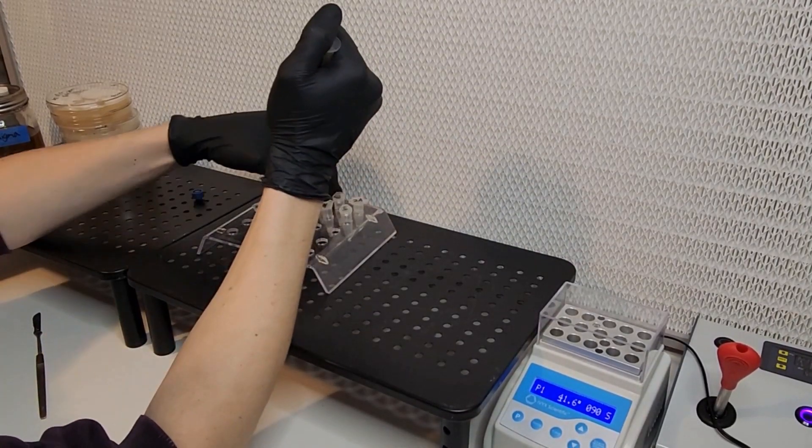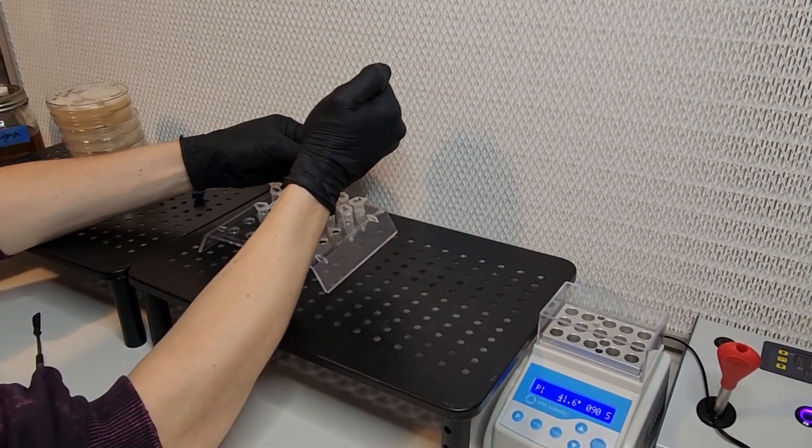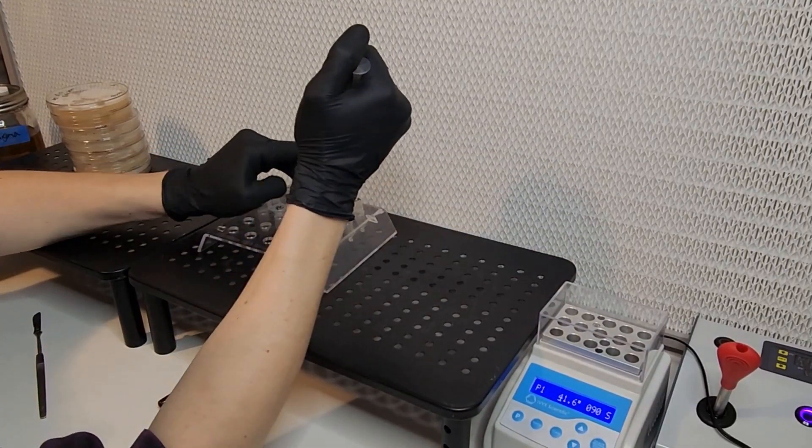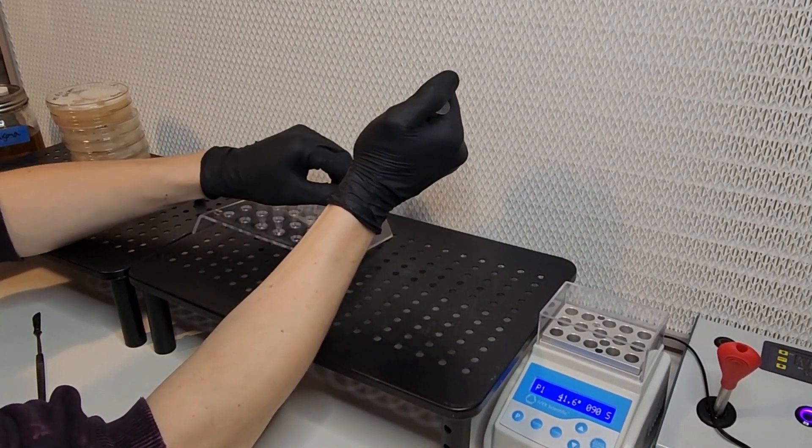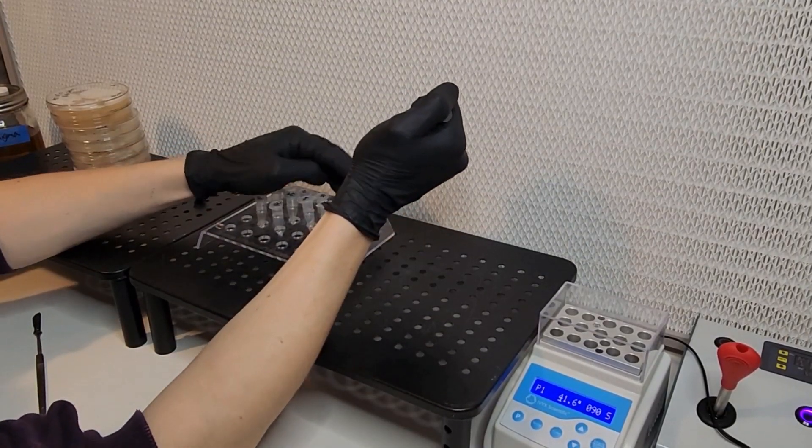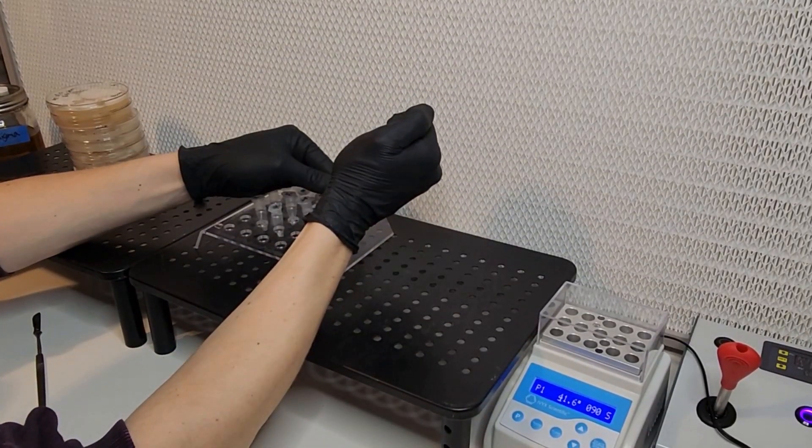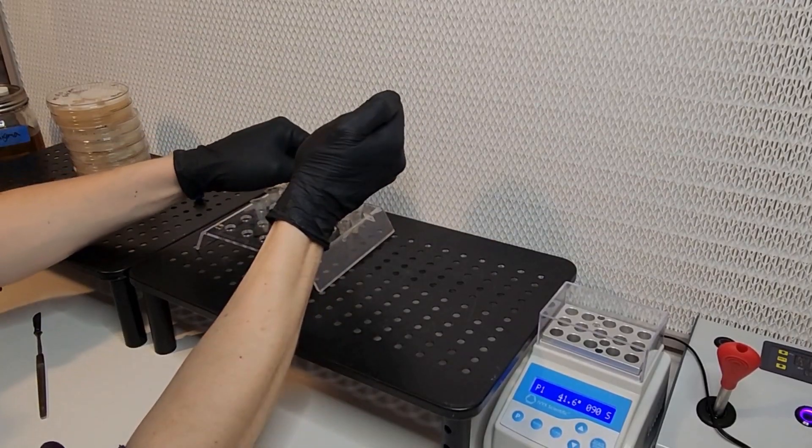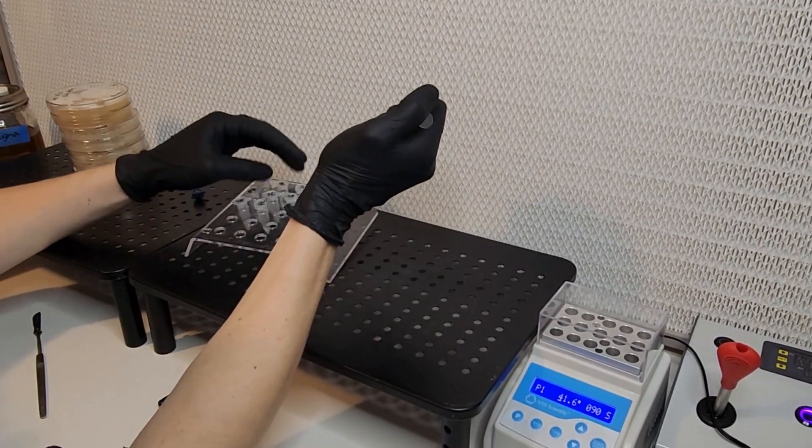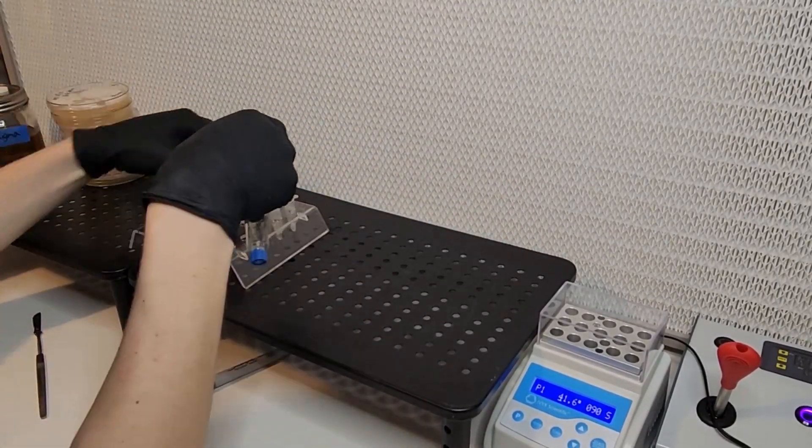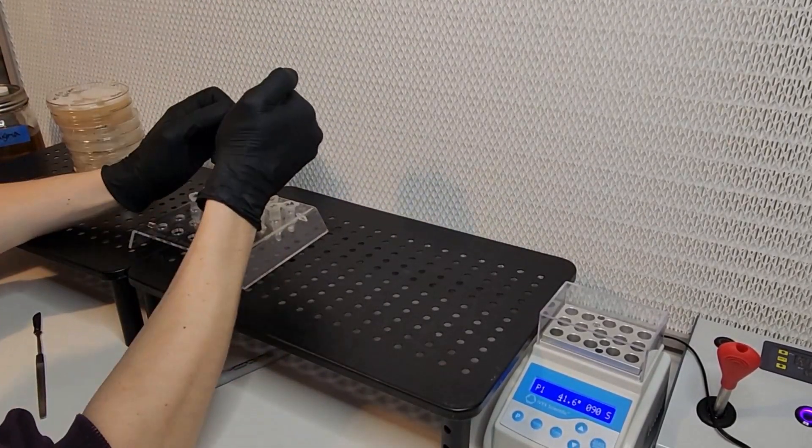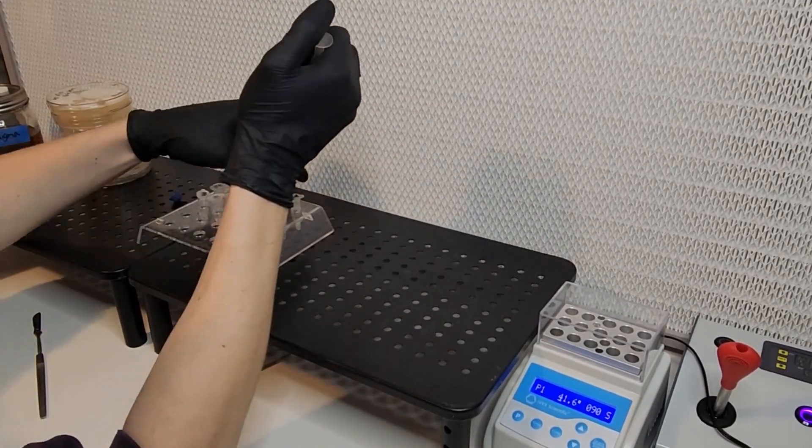I actually prefer doing this after using the pestle on each tube, but I just sort of forgot and did this one first. It doesn't really matter. But using the pestle before adding in your liquids will help you not spill any liquids anywhere.